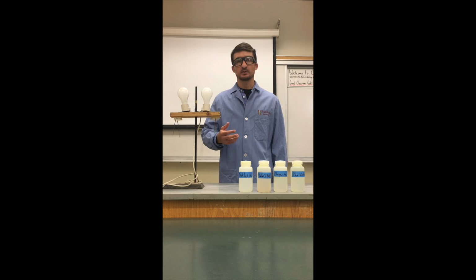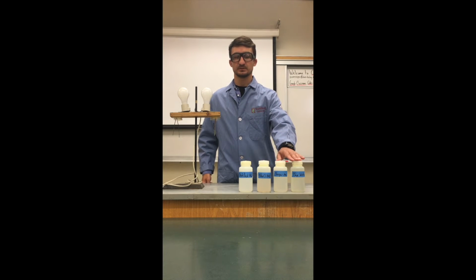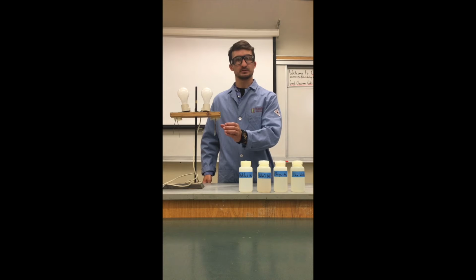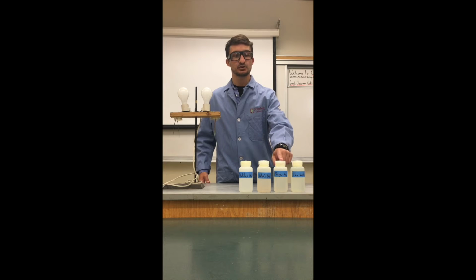Now, what we're going to be doing is taking each of these four solutions and submerging the two electrodes into the solution. So we have distilled water, we have a salt water solution, table salt, NaCl, we have a sugar water solution, and then we have a tap water sample.